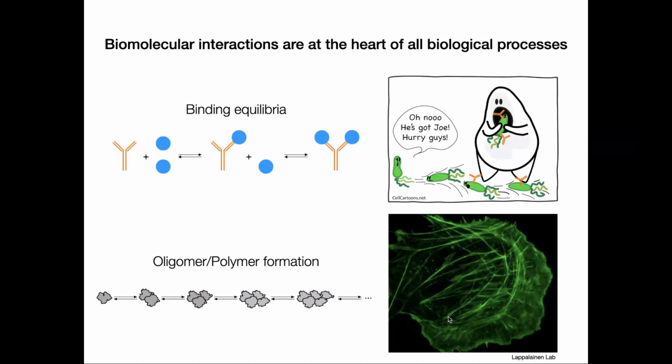because we can either use bulk techniques in order to look at average properties of the proteins at hand, or if we use single molecule techniques, then we need to often label the proteins in order to see them.